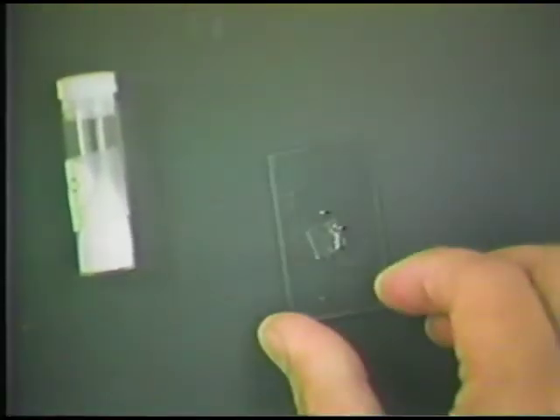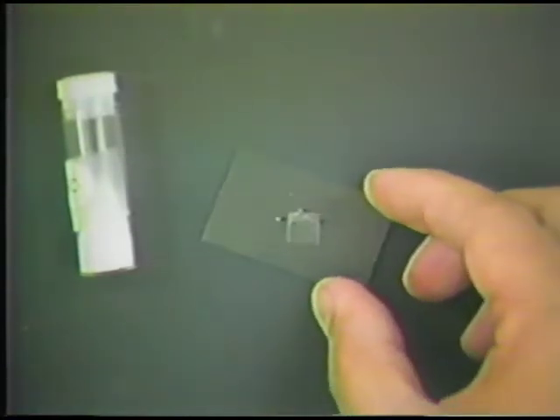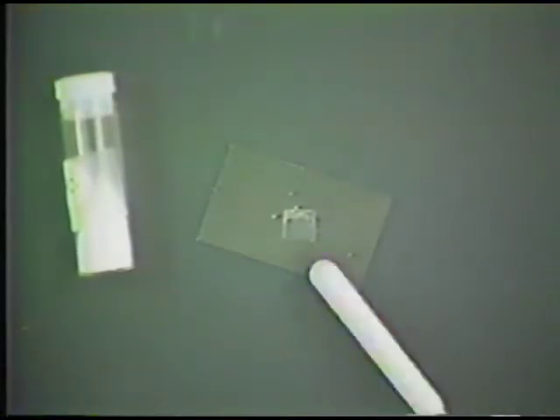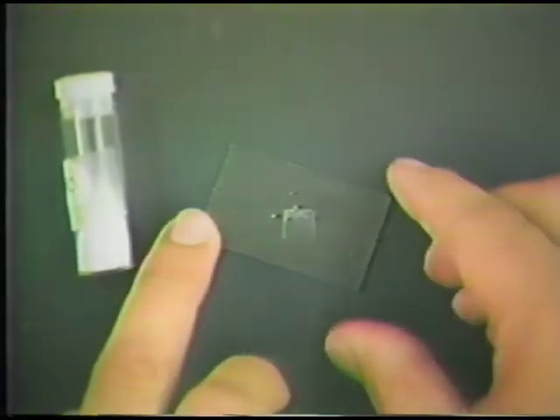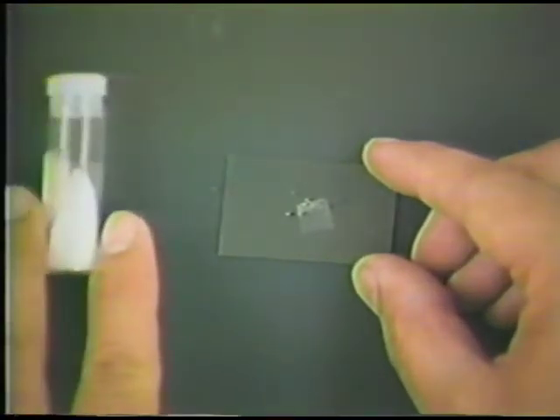And this is the making of something called an immersion mount. Now those mineral grains are bathed within an immersion liquid, and this immersion liquid can have any index of refraction that I wish, because I can take different indices of refraction and prepare them. And this is an immersion mount, another very common way of looking at mineral grains of some particular kind of composition.